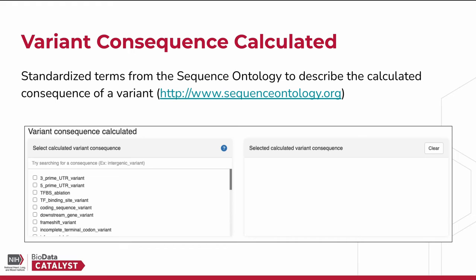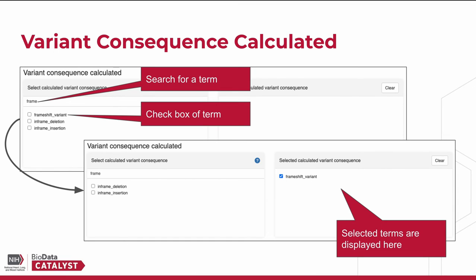The next section of the modal is called Variant Consequence Calculated. This field lists standardized terms from sequence ontology to describe the calculated consequence of a variant. For more information, you can visit http://www.sequenceontology.org. The functionality for searching and selecting a term of interest is the same as the Gene with Variant field. Let's say we're interested in frameshift variants. We can search 'frame' in the search bar. We can click on the box next to frameshift_variant and see that it is moved to the Selected Calculated Variant Consequence box.